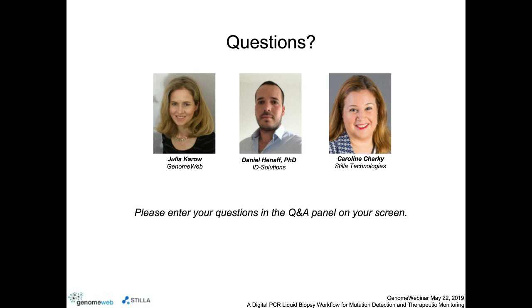Okay, thank you. Question for Caroline. The new 6-color system, how long will the process time be for that? The process time for the 6-color will be similar to the current 3-color. So right now, we do everything in 2.5 hours. The reading step only takes 10 to 12 minutes right now for the 12 samples.